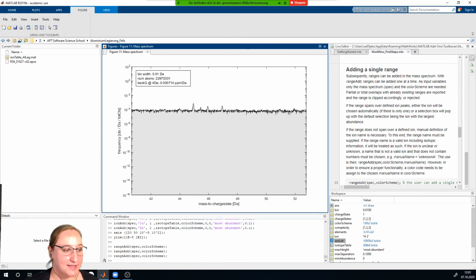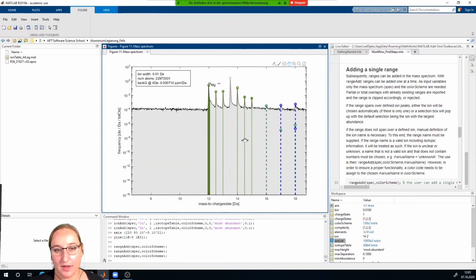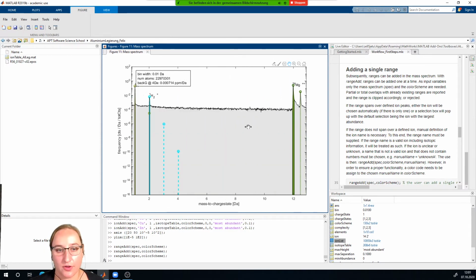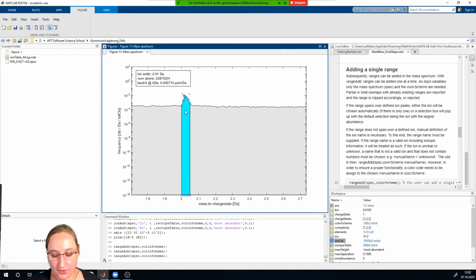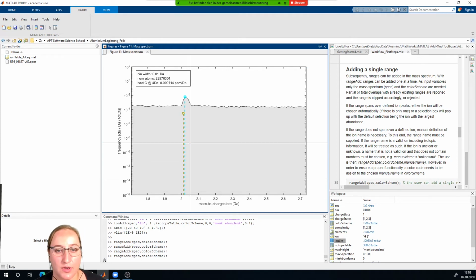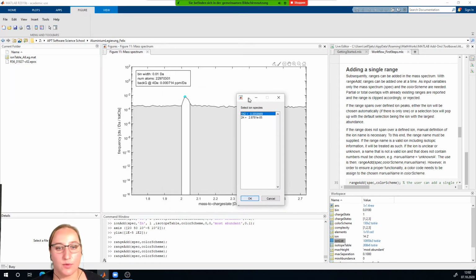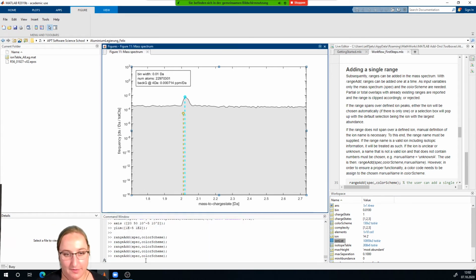And I see the question from Madam Teska. So you can arrange remove. It's the same with the ion plot. You can also go here, for example, again. And then you can select here the range. You delete the range. And then you can range it again. And then, for example, you can also use the other one and range it for the smaller one. But in our case, I think we want to have the first one.